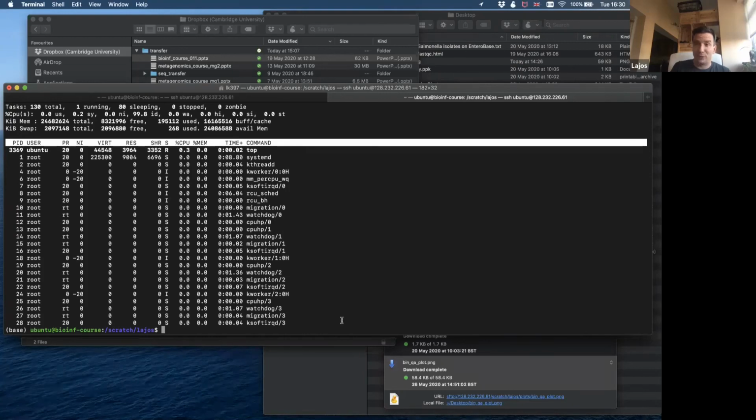Thanks very much for Joe. Now, I hope that you are not as disappointed as you were last time when we struggled with all these installations. This is how it should go. This is the normal way bioinformatics software usage should go. Then you only have to copy and paste the installation command and then start using the program. There are a few times when it's not as simple.